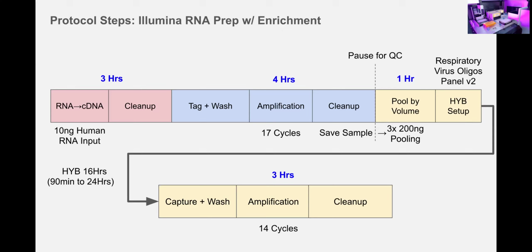If you so desired, you could design this to be semi-automated. Pretty much the reagents are just stamped from the reagent plate to the sample plate, and you focus automation primarily on the cleanup steps with the beads, the tedious repetitive washes you can automate, and anything trickier such as pooling or the hybridization, just handle that manually, up to the user. I mean, that's why we call this the Flex.